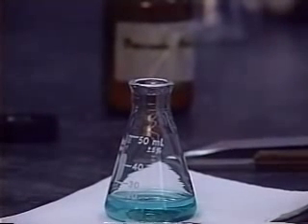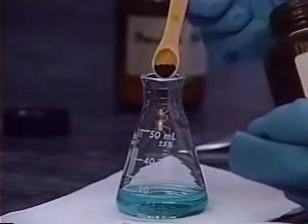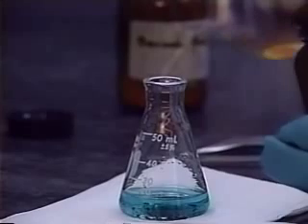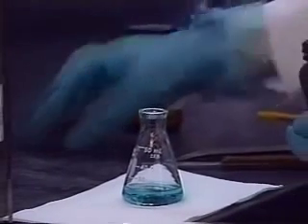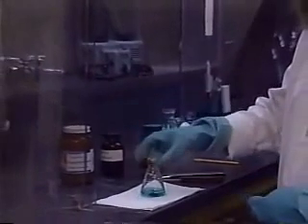Therefore, our demonstrator will add some norite, or activated charcoal, and swirl and heat for a few minutes. Norite is a decolorizing agent which absorbs on its surface highly colored materials.